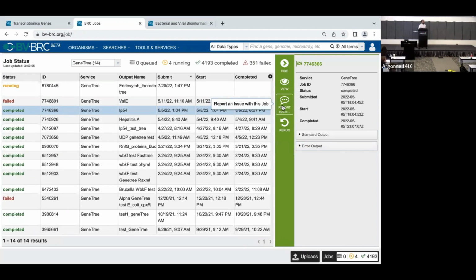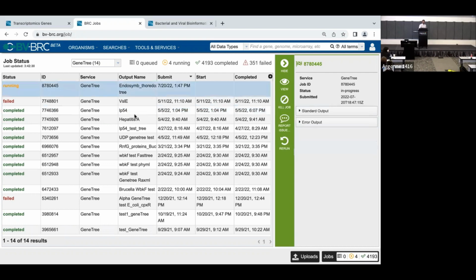We get them often because sometimes the pipeline says it completed, like it ran through the pipeline. And it could be an assembly job and it didn't find any contigs because it couldn't create contigs, because perhaps you submitted contig files, but it tried to run and it completed and it said, I'm done. I did what you asked. Not my fault, but it looks like completed to you and you click on it and you say, hey, where's my stuff? Then we have to describe it to you.